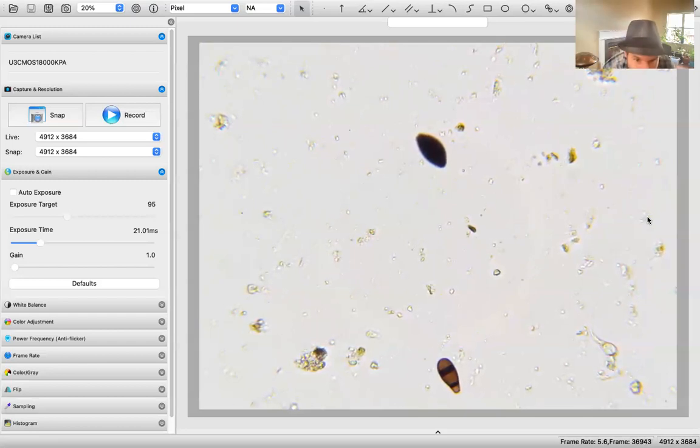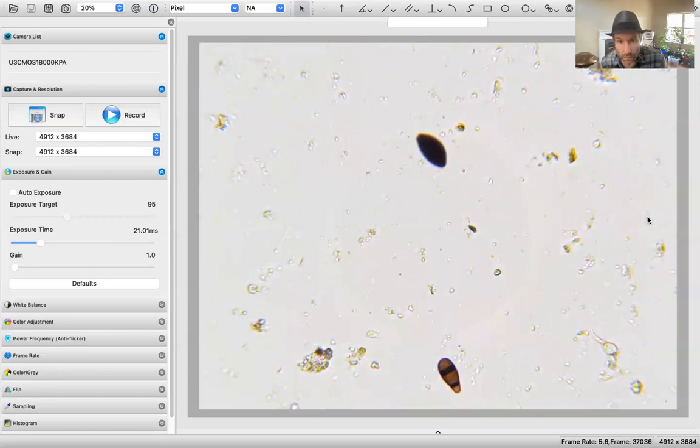Is that a flagellate in the bottom? No. It's hard to tell, man. It's got a lot of turbulence. Some assessments are easier than others for sure. So that's an NA on that one. Just making sure.